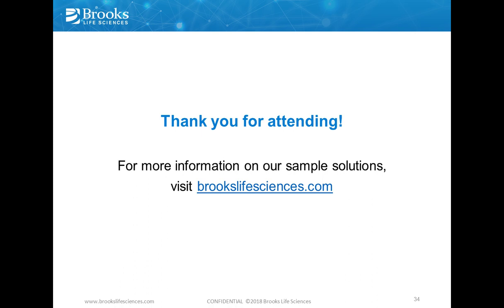Markus, do you have anything to add to that? No, I fully agree. I have the same view, and I think the only thing that may need to be considered is if we go for genetic analysis, then of course there's also information about the family in there, and I think that may be a point of discussion, where we do not have the full picture right now.